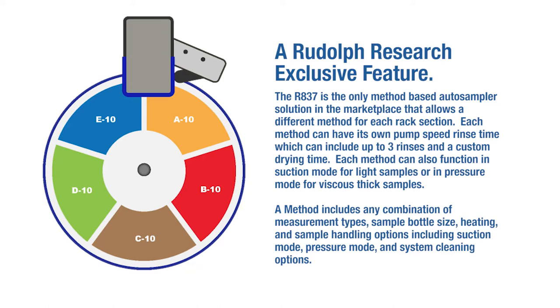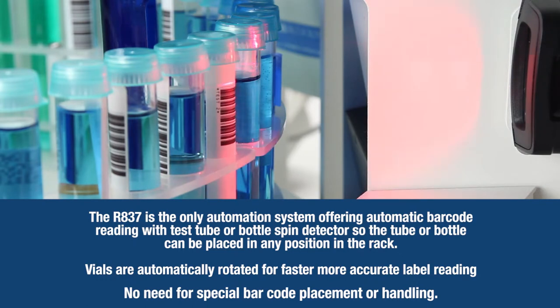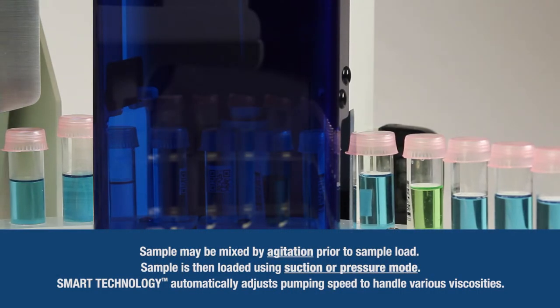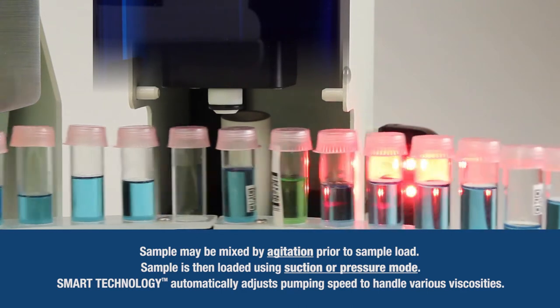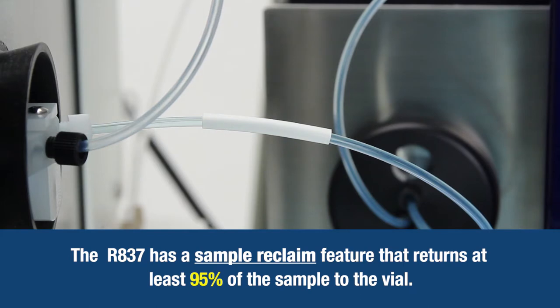Each method can also function in suction mode for light samples or in pressure mode for viscous, thick samples. A method includes any combination of measurement types, sample bottle size, heating, and sample handling options including suction mode, pressure mode, and system cleaning options. The R837 is the only automation system offering automatic barcode reading with test tube or bottle spin detection, so the tube or bottle can be placed in any position in the rack. Vials are automatically rotated for faster, more accurate label reading — no need for special barcode placement or handling. Samples may be mixed by agitation prior to sample load and are then loaded using suction or pressure mode. The R837 has a sample reclaim feature that returns at least 95% of the sample to the vial.